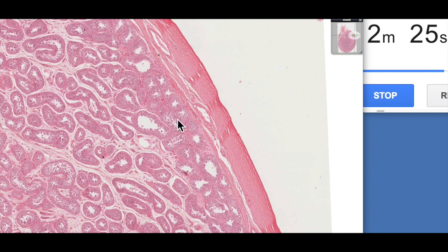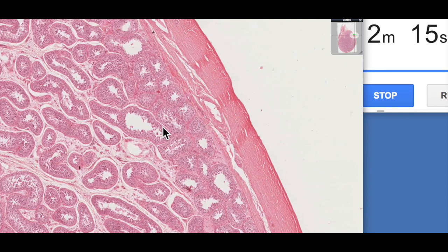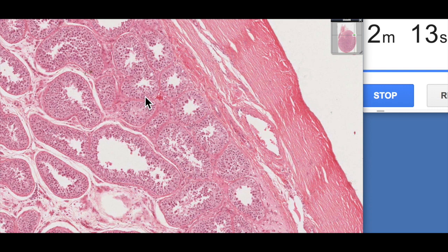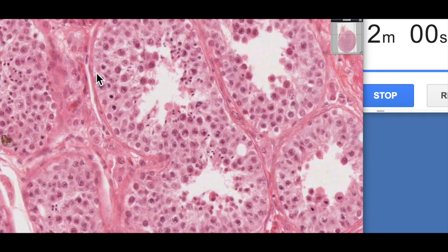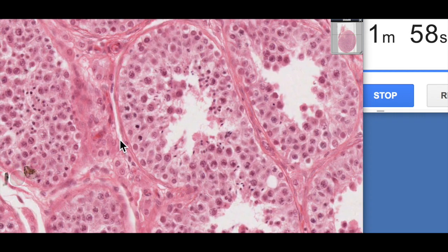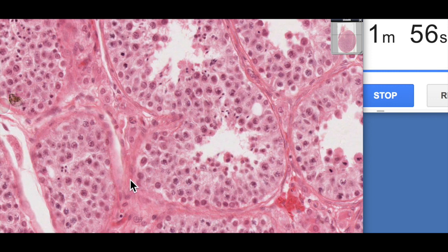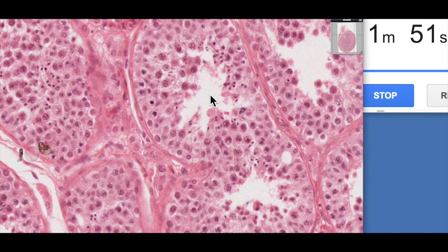Then we have a number of tubules — these are the seminiferous tubules. This is the site after puberty where spermatogenesis takes place, the formation of sperm. Meiosis in males takes place within these tubules. If you zoom in a little bit, we can see these structures are ringed by a capsule — the wall of the seminiferous tubules — made up of a number of flattened muscular-like cells called myoid cells, which are contractile and help move the sperm through the seminiferous tubules.